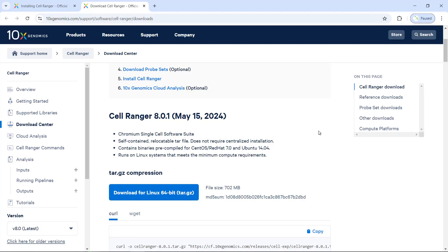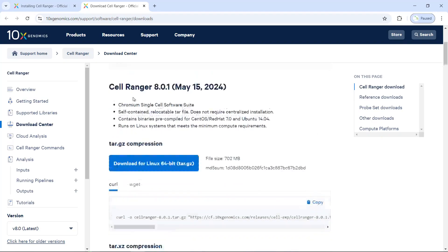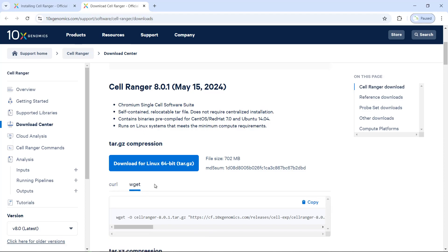For my demonstration today, I'm going to install CellRanger 8.0.1. You can see there is a link on the page. We can use wget and copy this code to download this version. So we have now copied the link for downloading CellRanger.